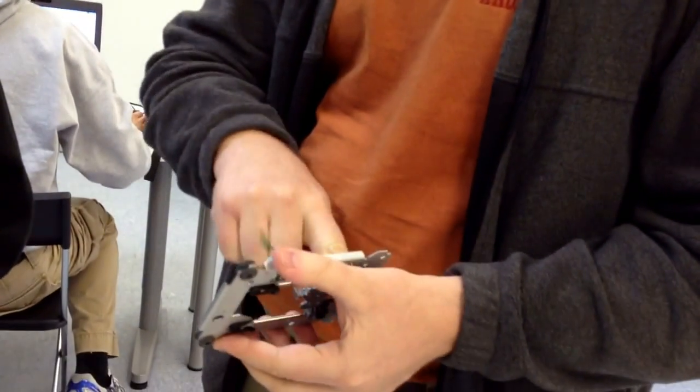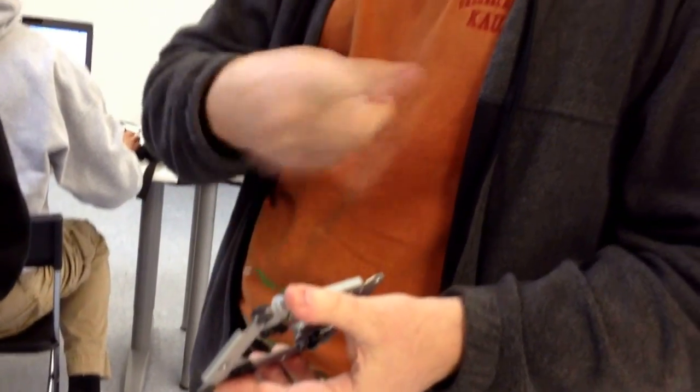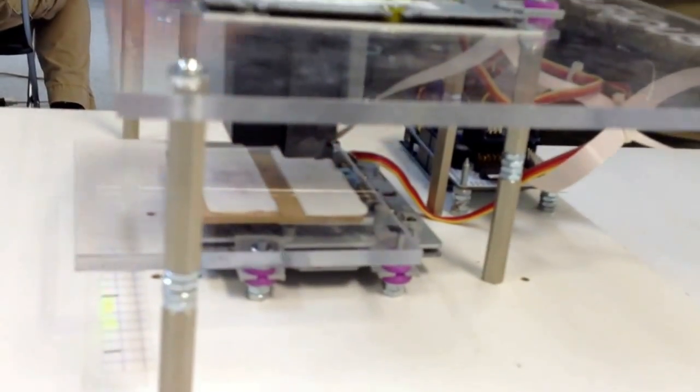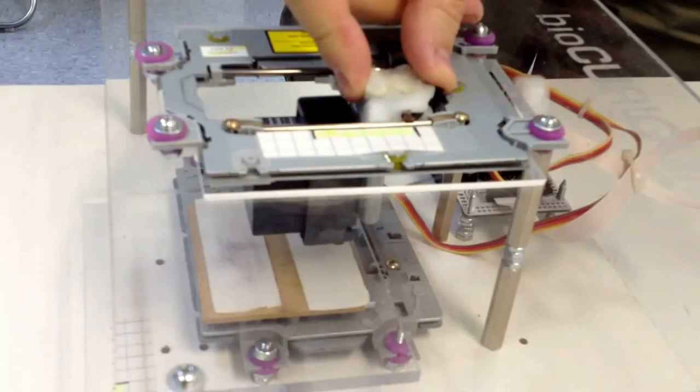This is normally where the spindle motor would be, the drive that spins the CD itself. So we have one at the bottom here that moves this platform, and we have one on the top that moves this print head.